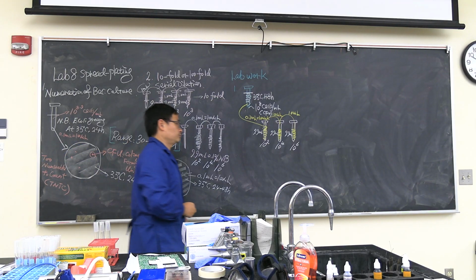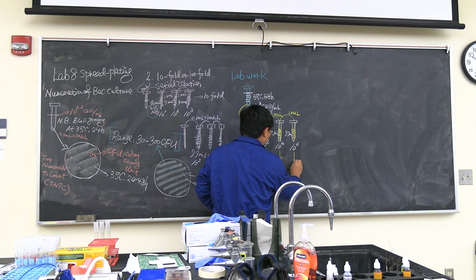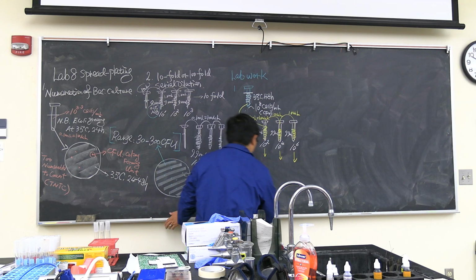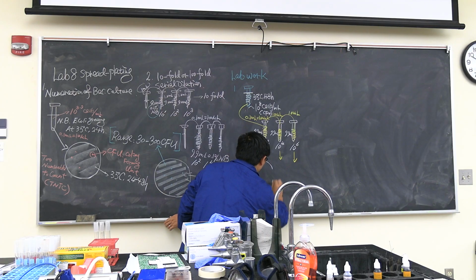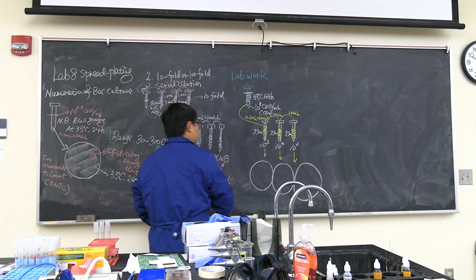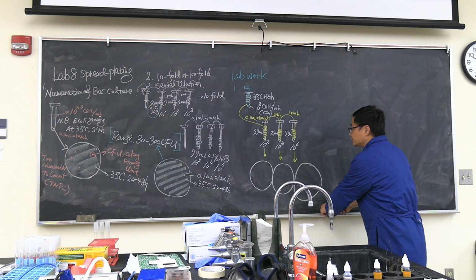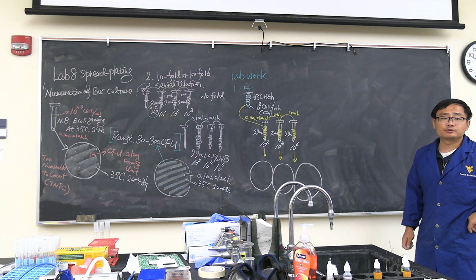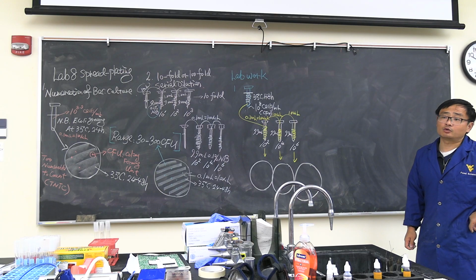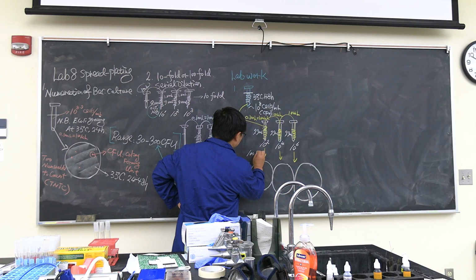Now there's a tricky thing. We're going to add into our agar plates. The agar plates are right here. Once you add into the agar plates, how much volume do we use? We don't add 1 ml because it's too much. So we are adding 100 microliter.